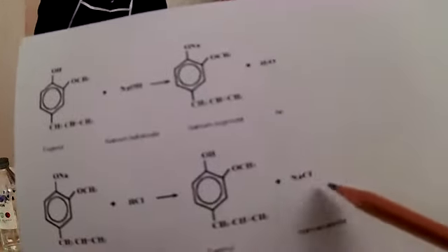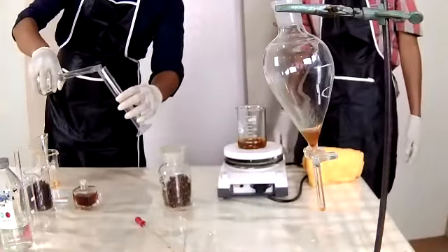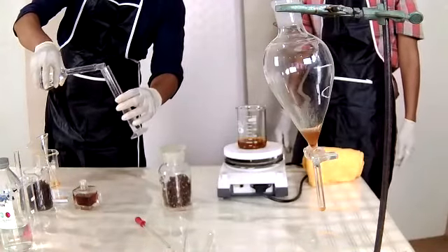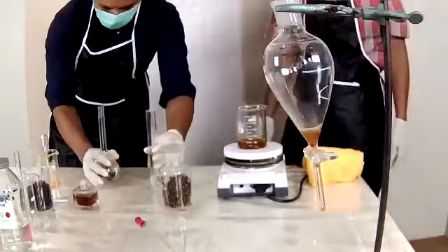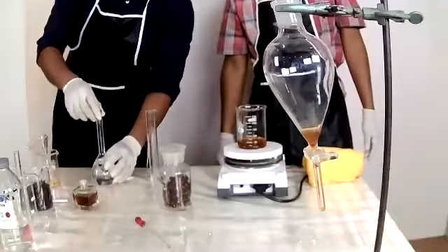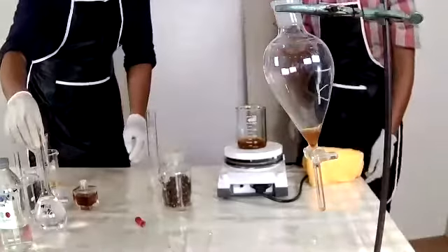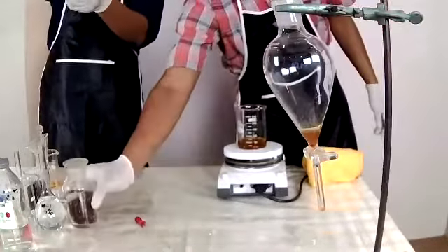And we will see the eugenol and also the other part that we used to react this extract. So we add the hydrochloric acid, and we need to have the exact measure to reach the balance of the reaction.